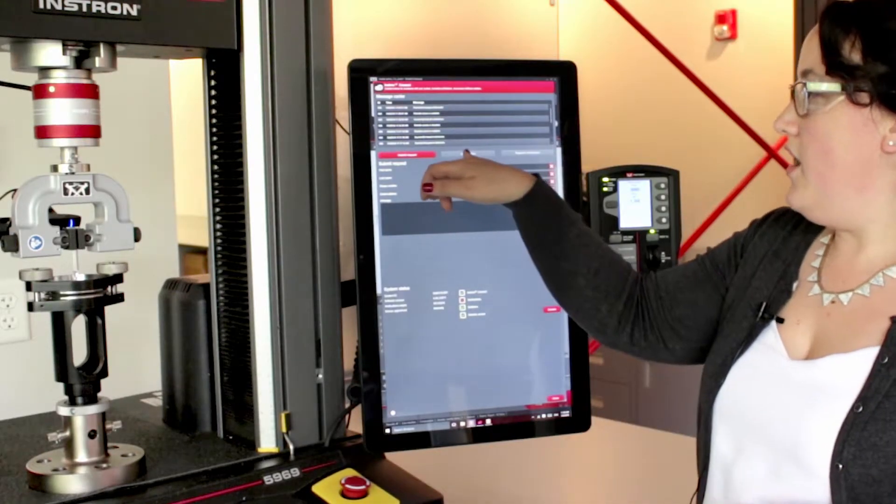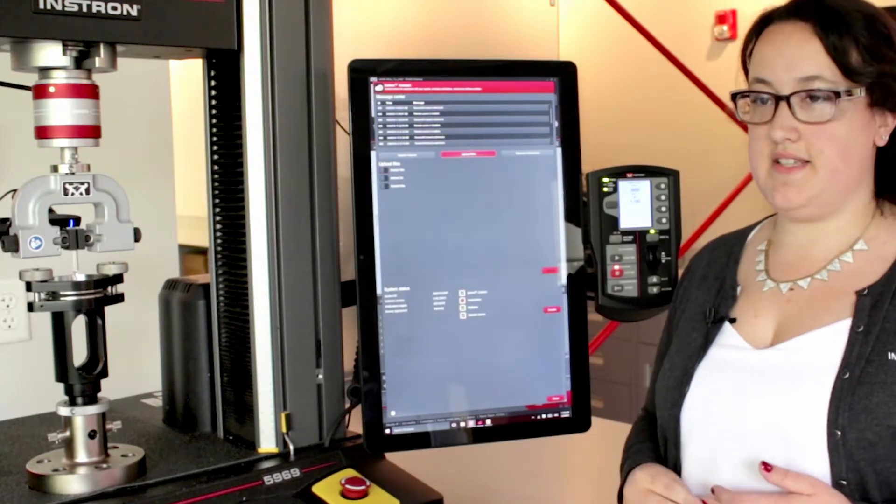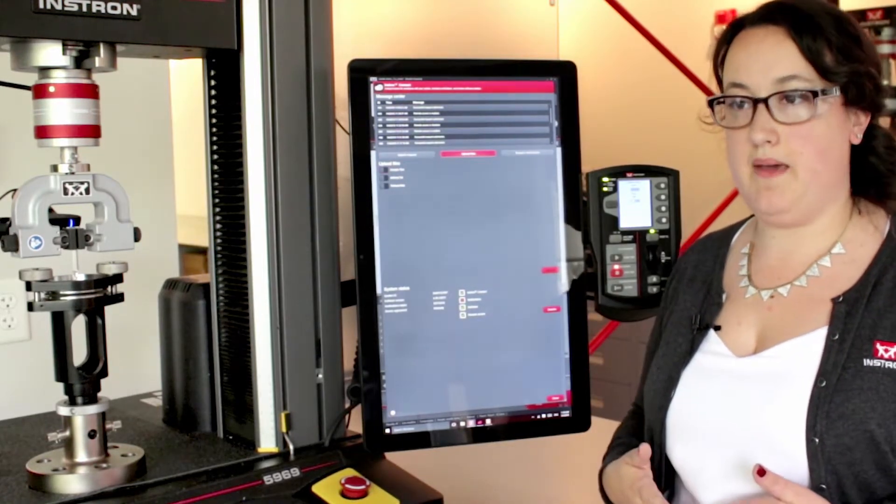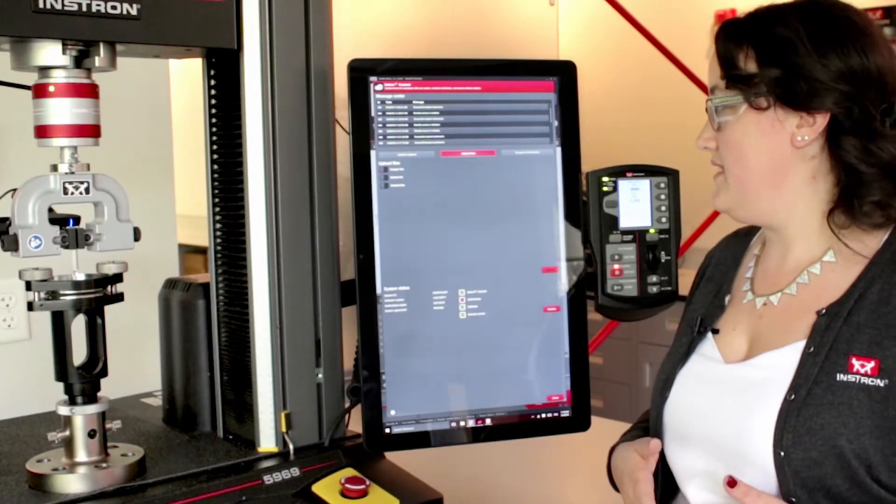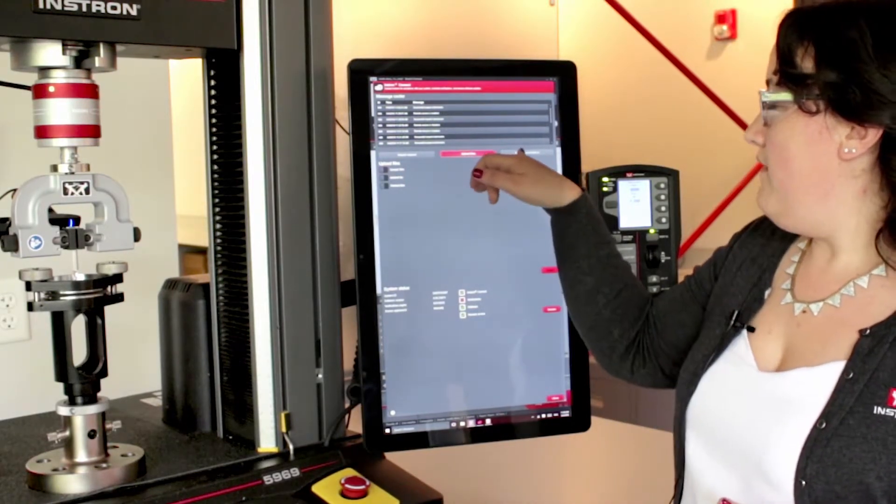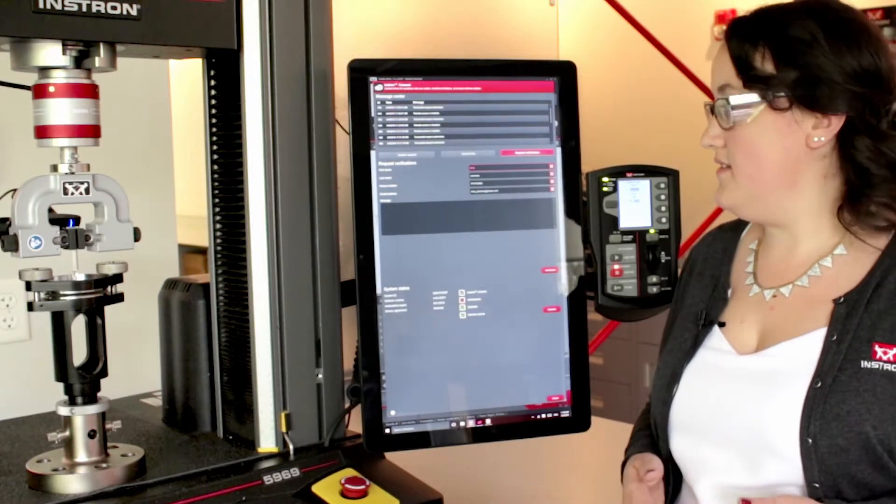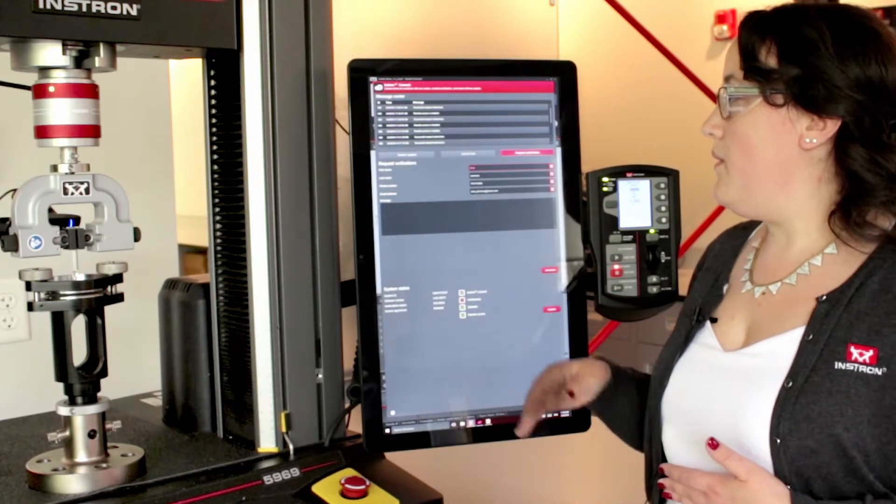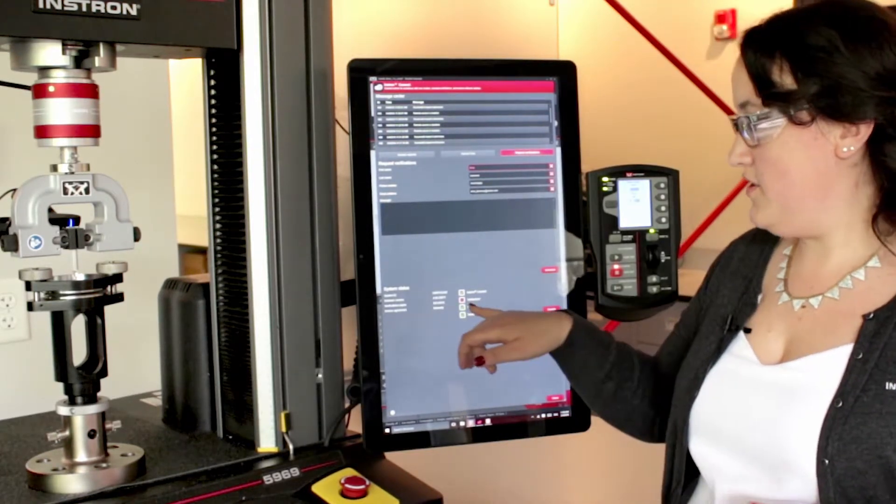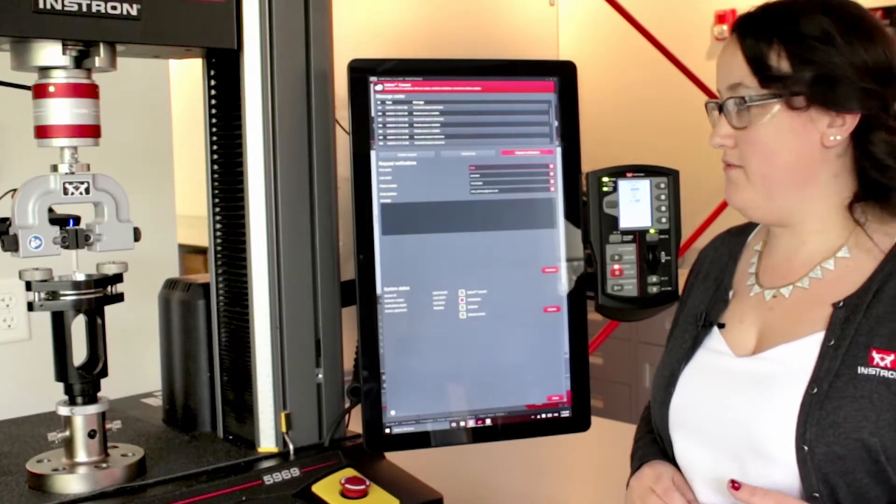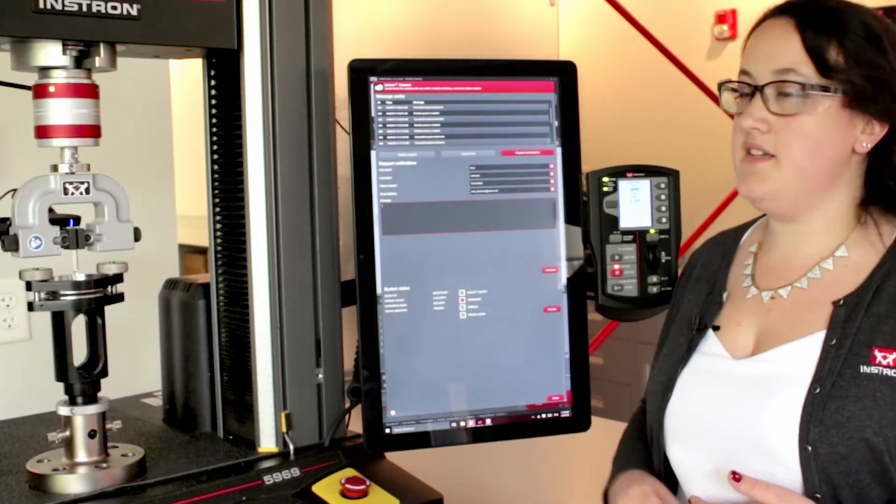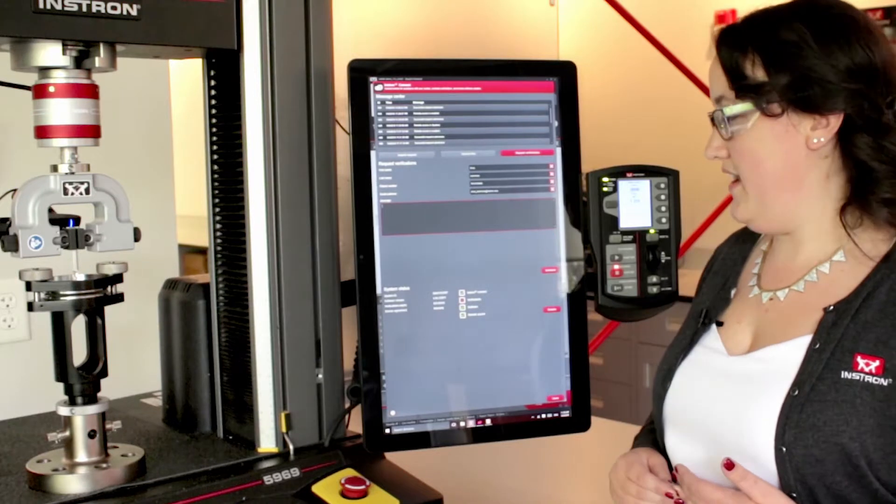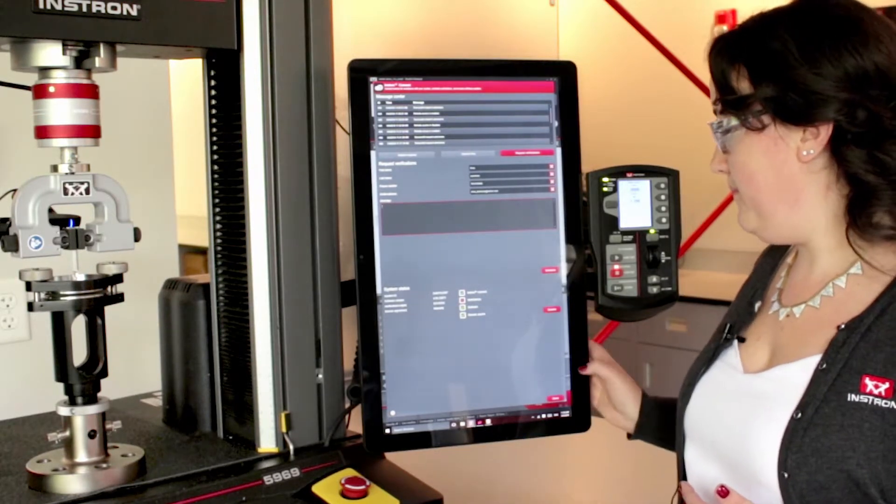I also have the ability to upload sample and method files, as well as other things that may be related, such as photos of my test setup. Finally, I have the ability to request verifications. So if I need verifications, which there's a nice reminder of down at the bottom of my screen, I can simply send a message to my service representative to request them to come in.